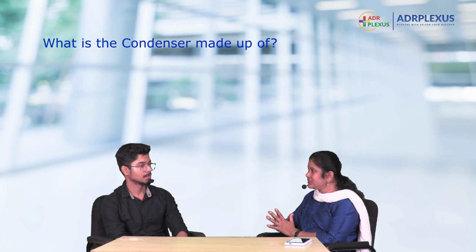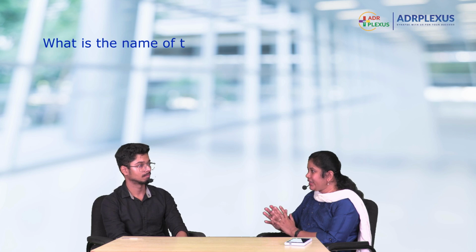Very good. And we have the diaphragm, the iris diaphragm, and the condenser, ma'am. What is this condenser made up of? Condenser is made up of different types of lenses, ma'am. It's actually the spherical lens only. Is there any particular name for that condenser lens? Abbe. Very good. Excellent. This is a star question. So the condenser uses the Abbe type of lens system. It's again a convex lens. Right. What is the purpose of this iris diaphragm? It adjusts the amount of light that is falling on the object. Do you have any similar system in our body?